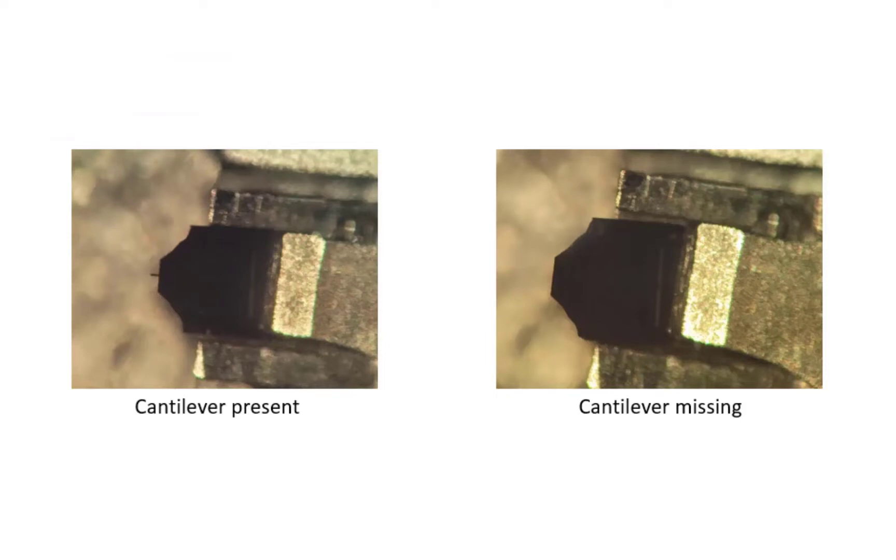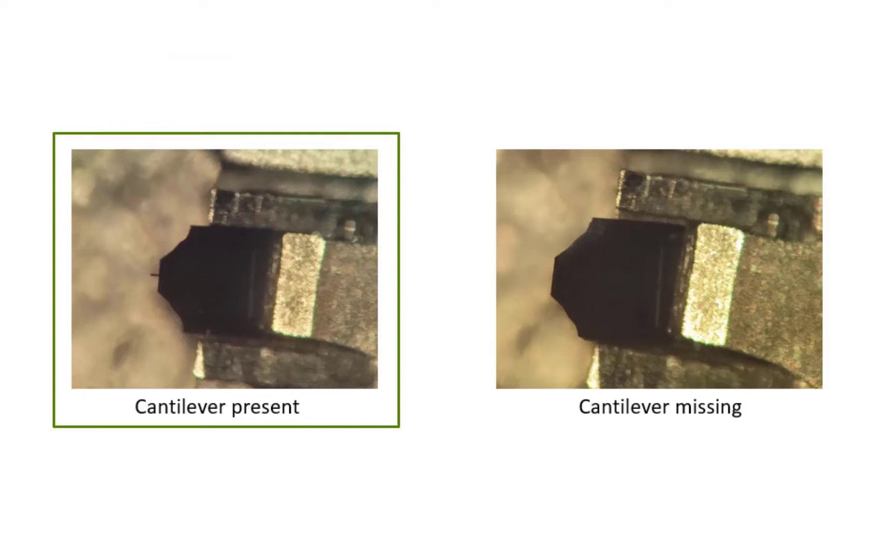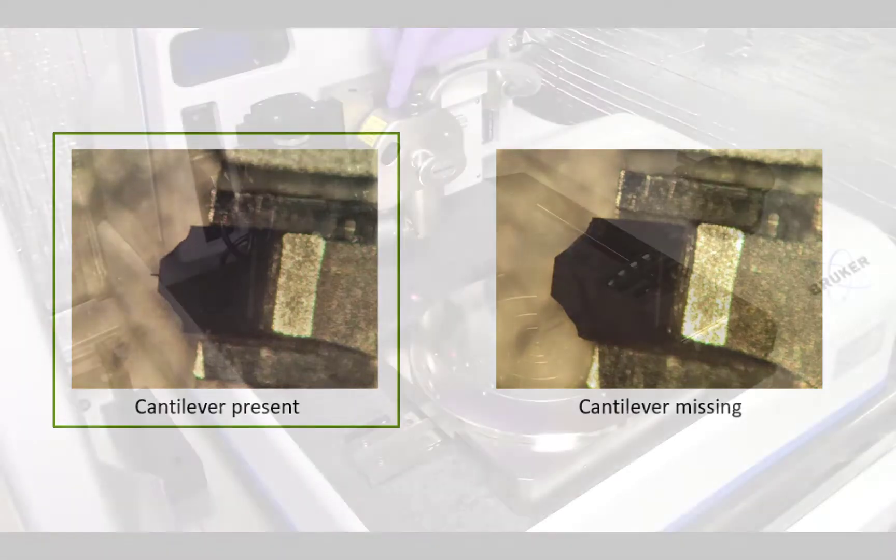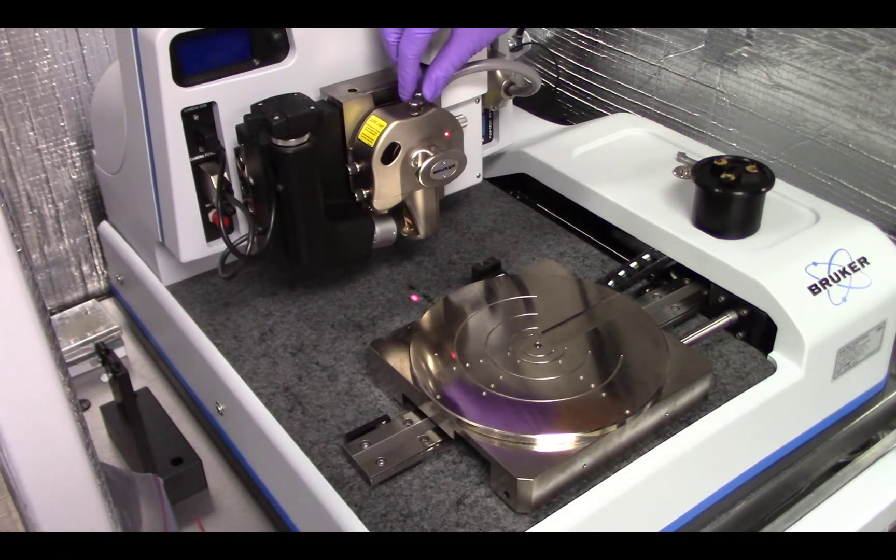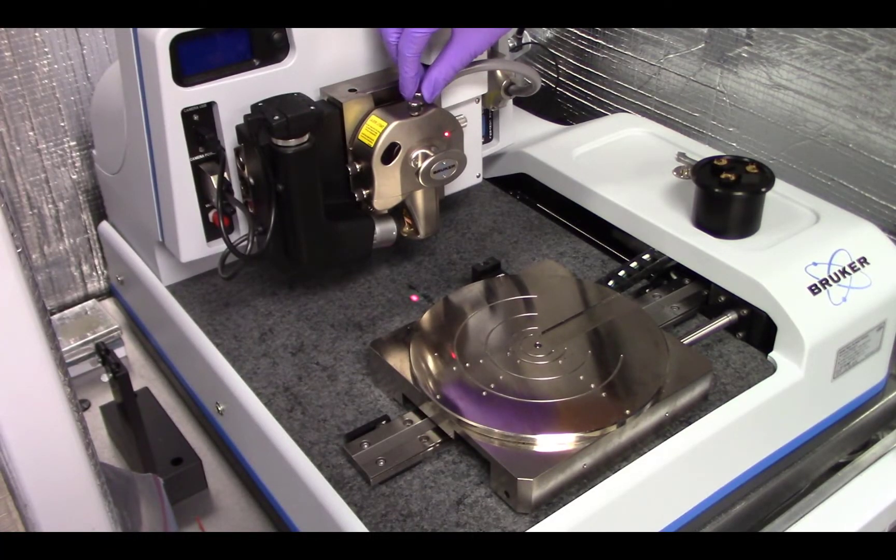Before going any further, it's always a good idea to double check that the cantilever is still attached to the probe, since it can easily get broken off when loading the probe onto the scan head. To do this, we will be moving the laser by using the knobs located on the top of the scan head.